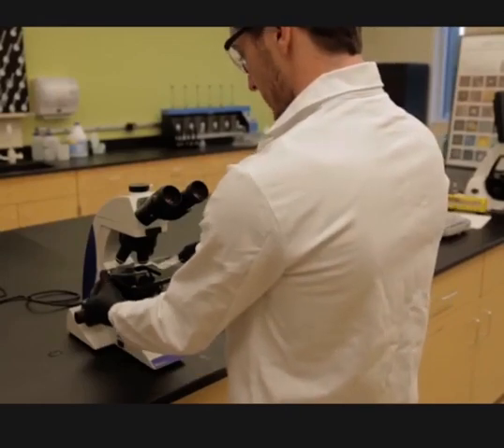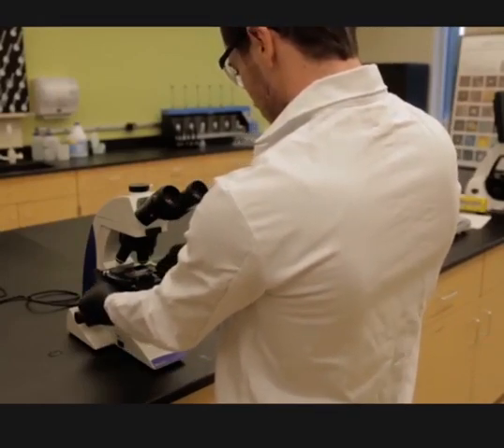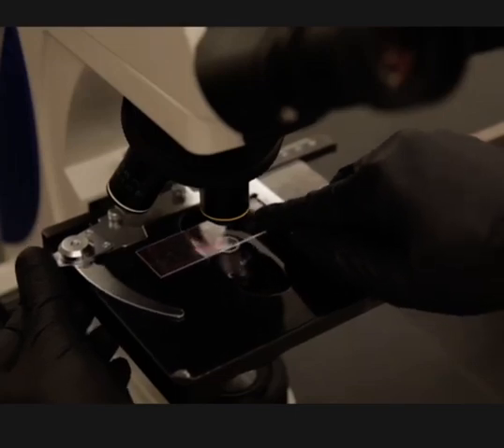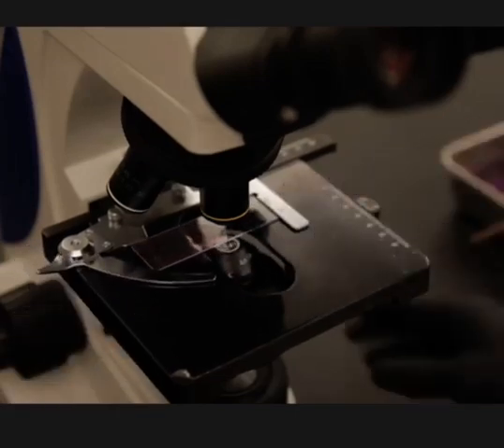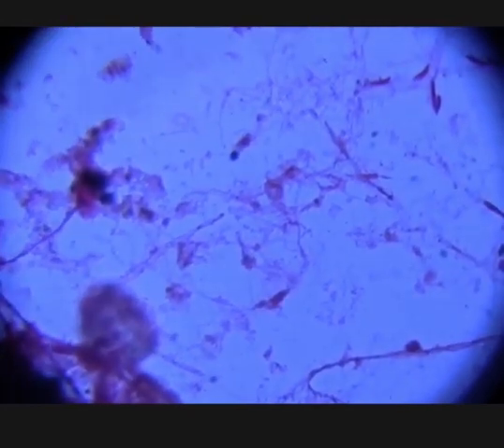Examine the slides on a light microscope using an oil immersion objective. The treated soil will have more soil microbes. The spatial interactions between fungal and bacterial organisms in typical soil samples can easily be visualized.